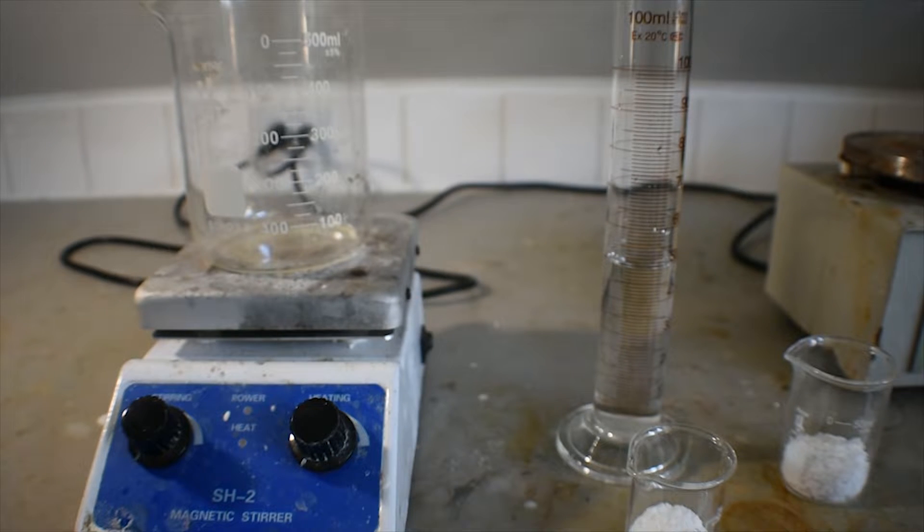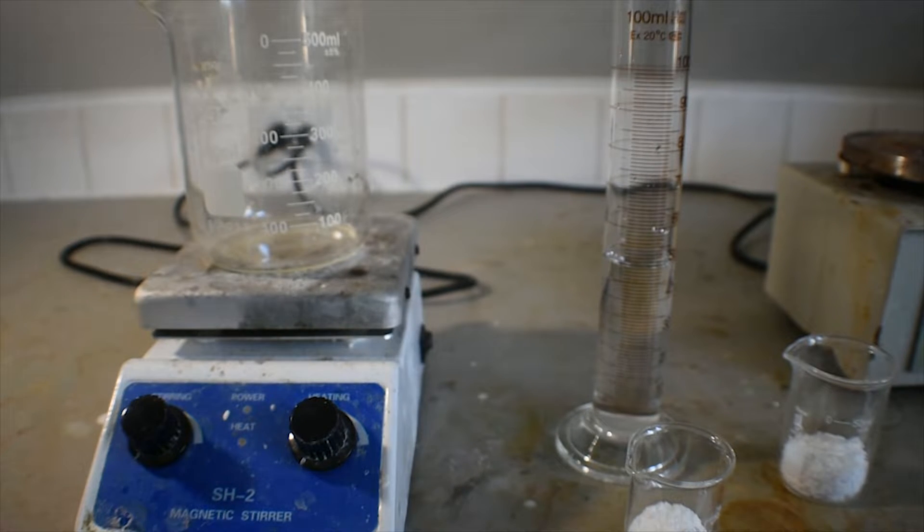Hello everyone, welcome back to another video. Today I'm going to be preparing potassium metaperiodate via the oxidation of potassium iodate.